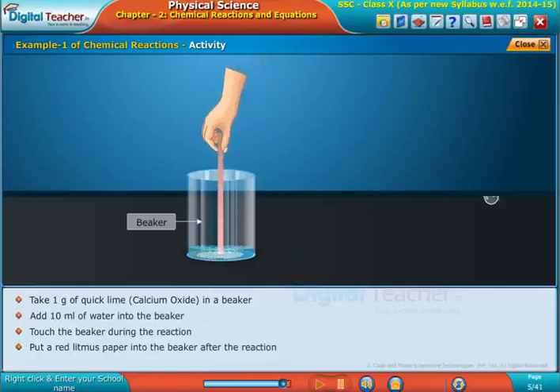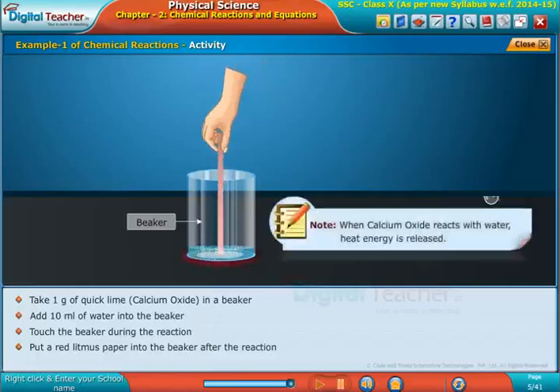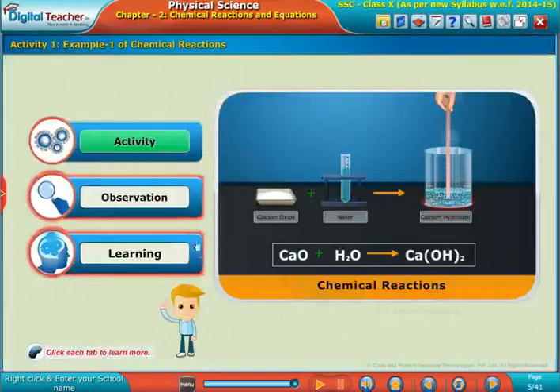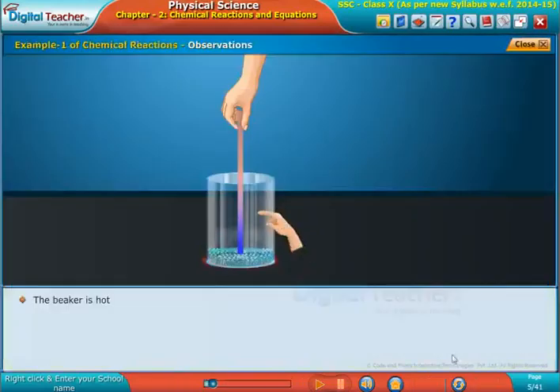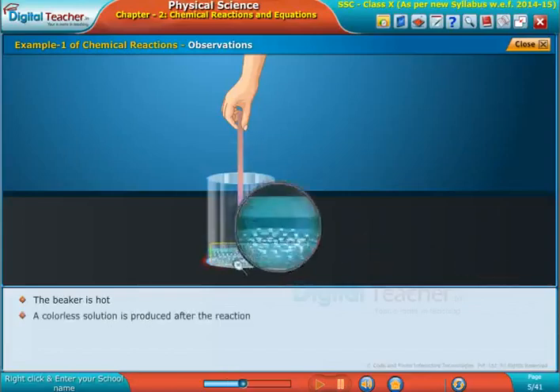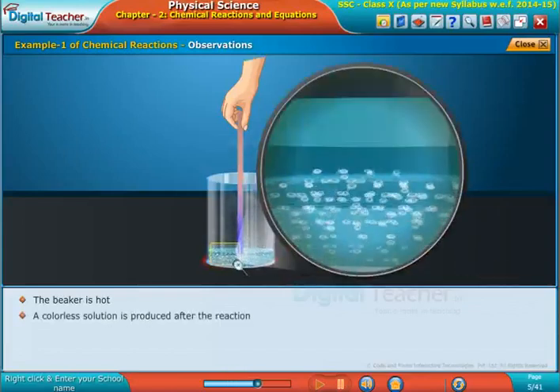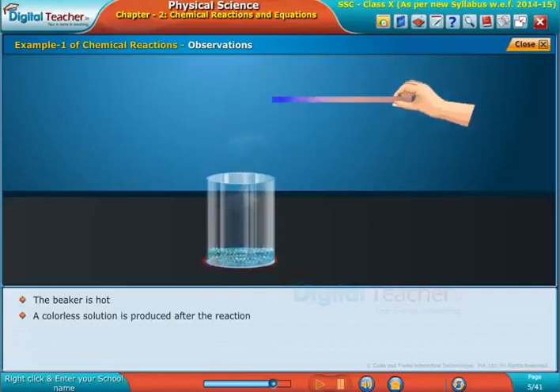The beaker is hot. A colorless solution is produced after the reaction. The red litmus paper turns blue.